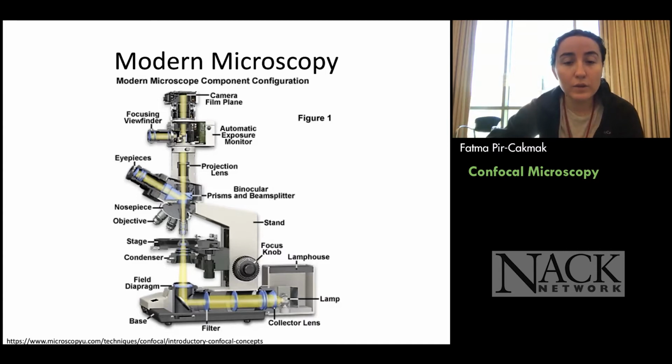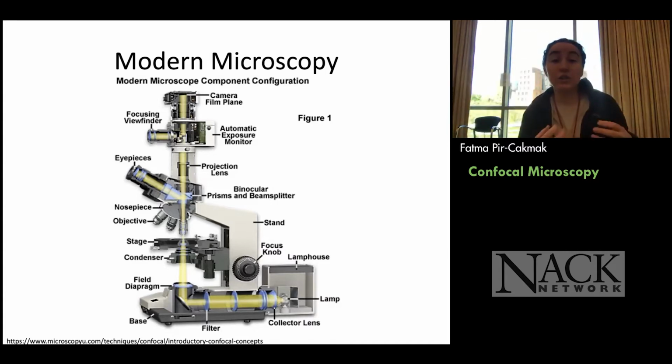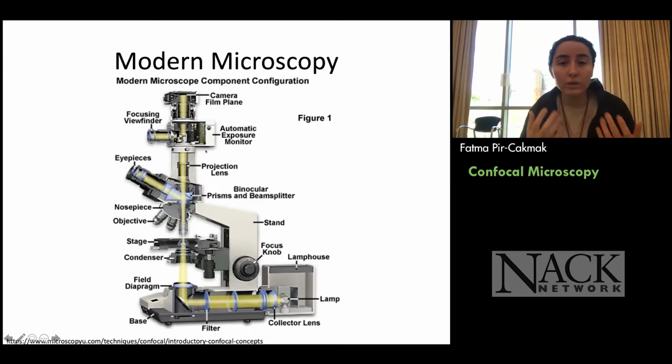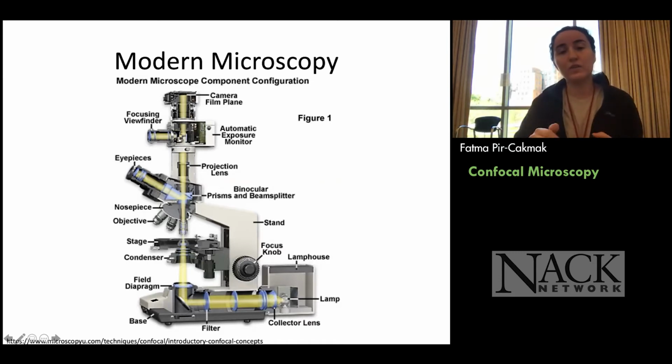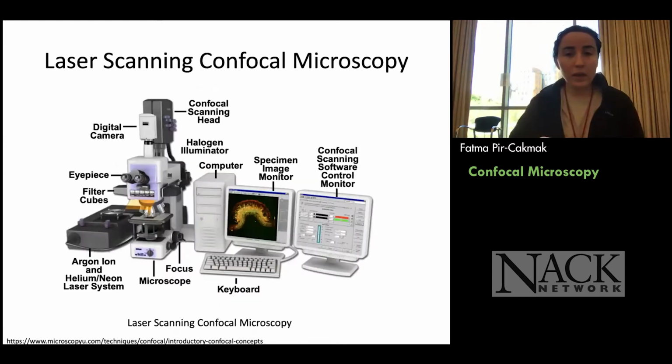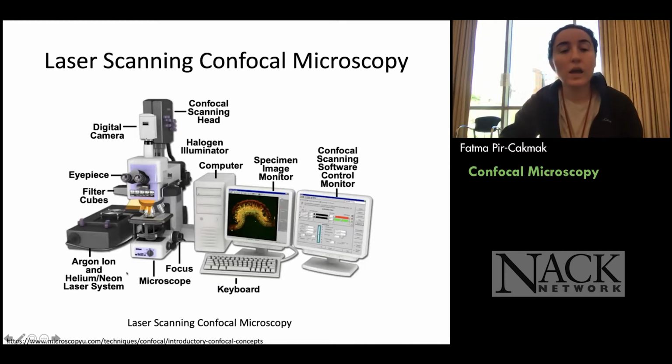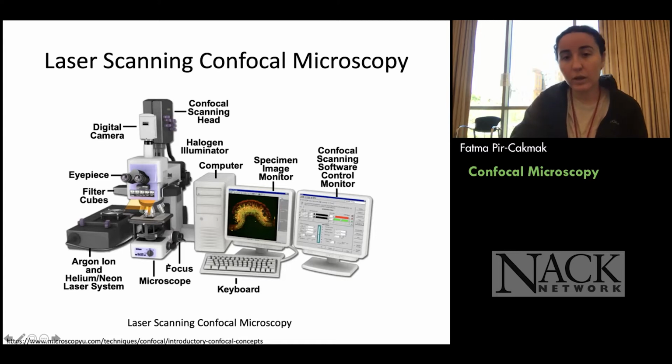You can have a computer to reflect whatever you are seeing. You can focus your sample. You can have all these things, and it's easy to customize them for your sample. As I said, you have the eyepiece, filter cubes, and the lasers, and you have your sample here, and the computer showing whatever you see.